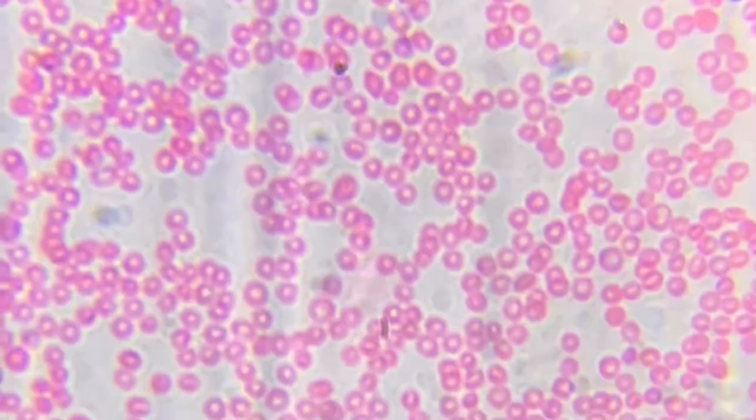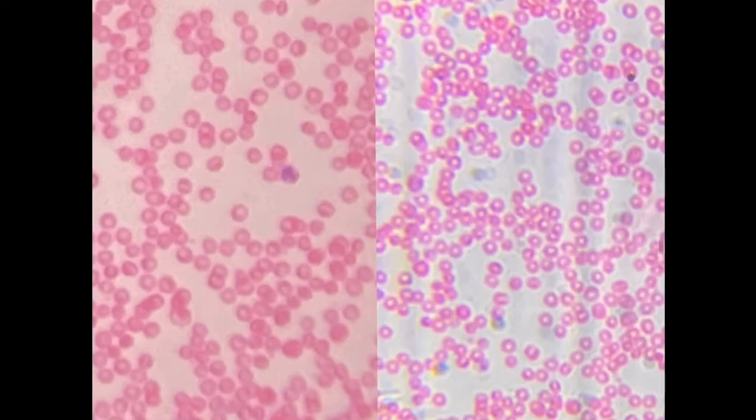The first image was taken with our microscope lens paired with our phone attachment, and the second image was taken with a microscope. As you can see in these images, no major differences in clarity or quality were perceived between the microscope lens and the traditional microscope. This means that the phone attachment was as effective in recording the details of the blood slide and provided a more efficient and accessible alternative.